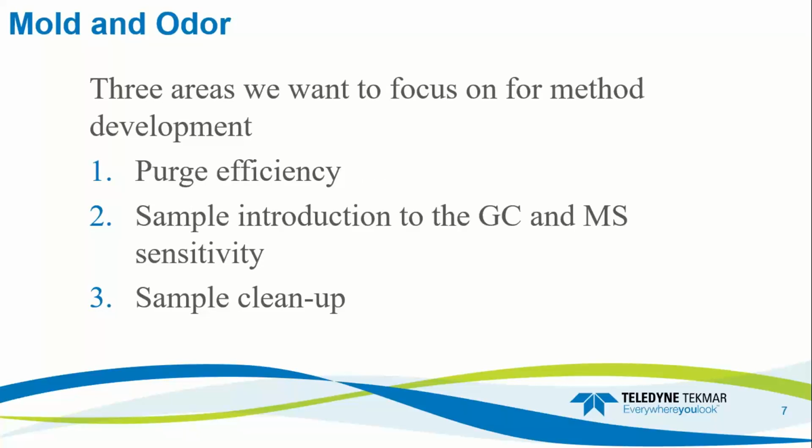Taste is becoming an increasingly important aspect of water quality. Detecting and eliminating earthy-musty odor compounds is critical to water suppliers. So when we say earthy-musty odor, we're talking about two compounds of interest, geosmin and 2-methylisoborneol, or MIB. These two contribute to the musty smell of finished drinking water.